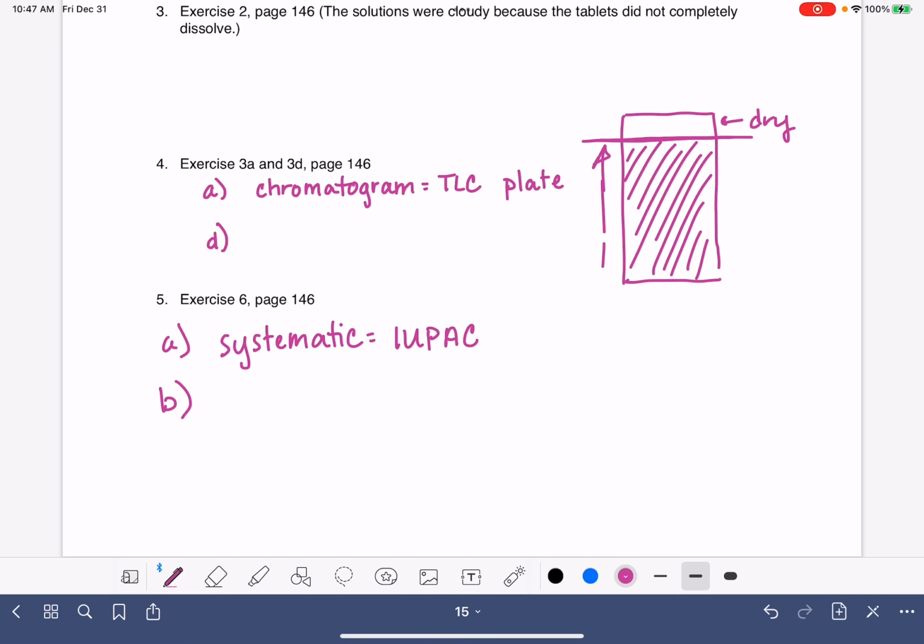Why do you think the physiological effects of naproxen are similar to one of the drugs that you looked at in the experiment? And why are they the same? To give you a hint, I want you to look at the molecular structures of the compounds. What substance is structurally similar to Aleve?